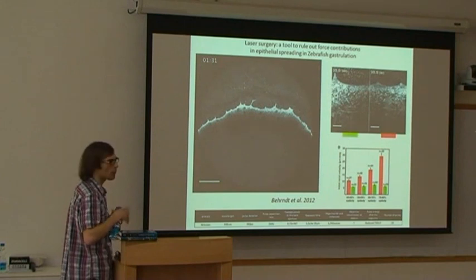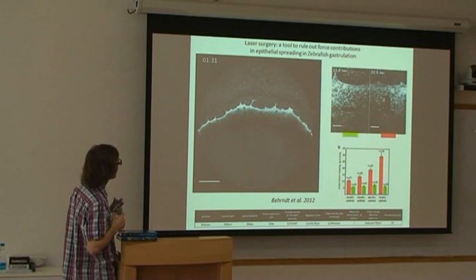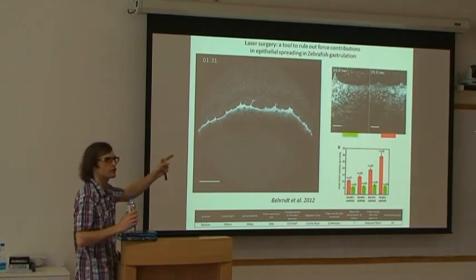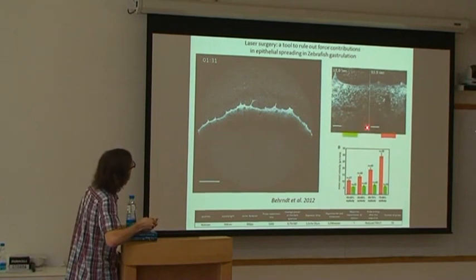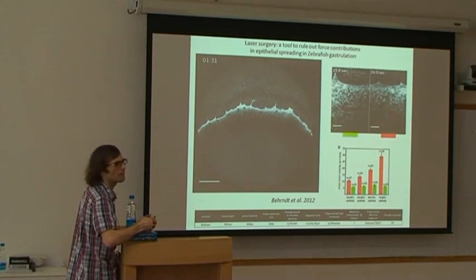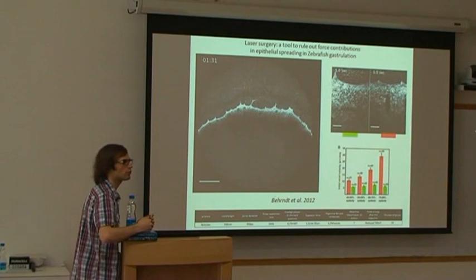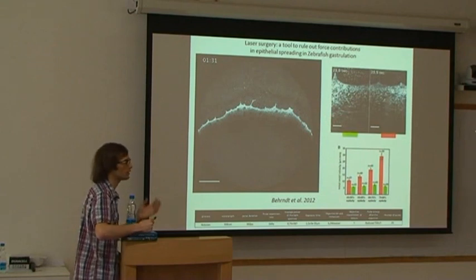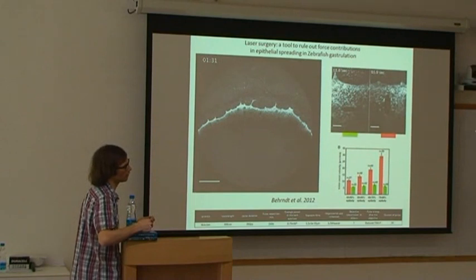But now I would like to look better at this movie, and I want you to be more critical. Okay, we see the relaxation, but it's very interesting that if we continue to look, we also see a recovery of the meshwork. And what is interesting is that the recovery on the right seems to be much faster than on the left. So if one wants to be more critical, one would say that probably the meshwork here is not exactly the same as here, like if the two experiments were not done exactly at the same stage, even though the paper says they were done at the same stage.